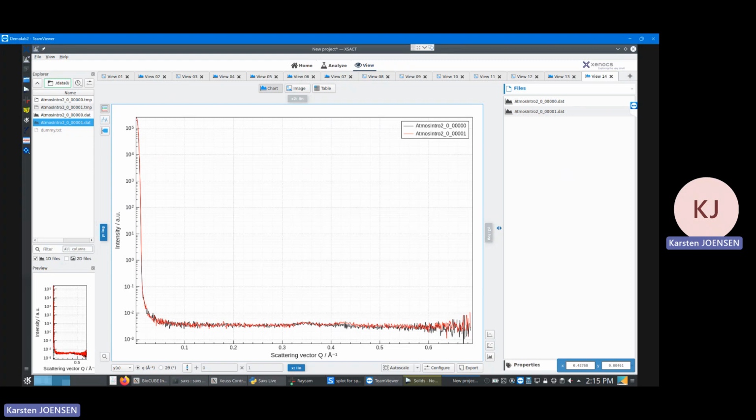keep in mind. In general, you could say that the smaller the hole that you can be going through, or the more restricted it is, the less you'll see from that first Kapton window. As a corollary to this, you could also say that any specific shape that your sample holder has, dog bone or any kind of other shape, could result in a shadowing, as the radiation from that first Kapton window could be blocked differently by your sample holder. So that's just something to consider, that if you see some strange shadows in your two-dimensional data, you could in fact be seeing a shadowing effect.